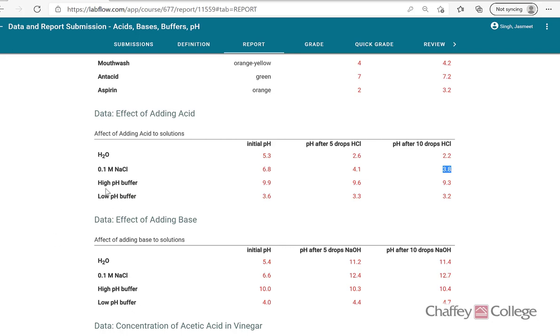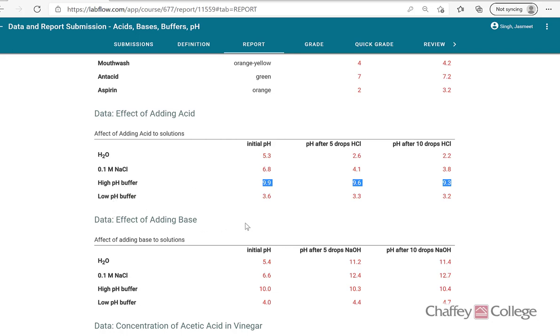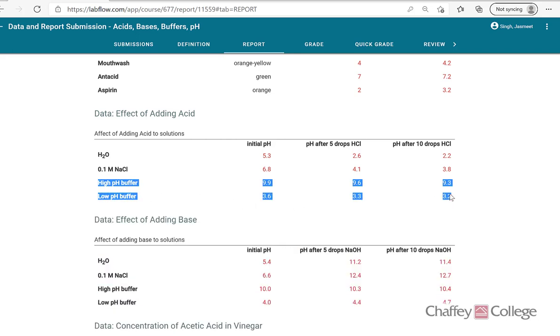That typically happens to any solution when you add acid — the pH drops. Now let's look at what happens to the pH of buffers when we add acid. We have a high pH buffer with an initial pH of 9.9. After adding five drops of HCl it remained about the same — there is a slight decrease, but that is negligible compared to other solutions. After adding five more drops, the pH dropped to 9.3. As you can see, more or less the pH of the buffer remained constant even after adding 10 drops of acid. The low pH buffer, with initial pH of 3.6, also showed very little change after adding a few drops of acid. Buffers resist the change in pH after adding acids or bases.